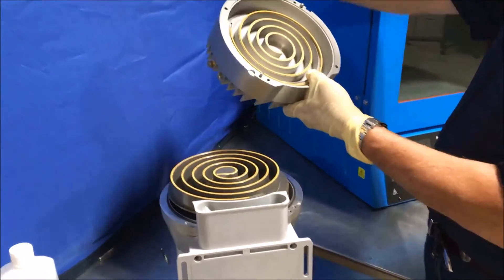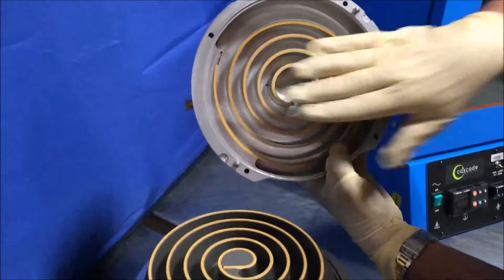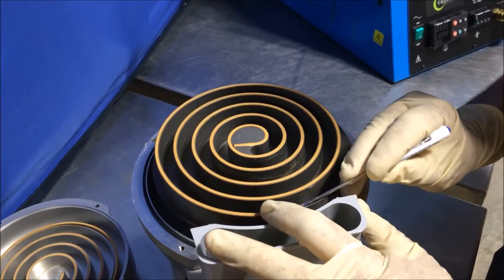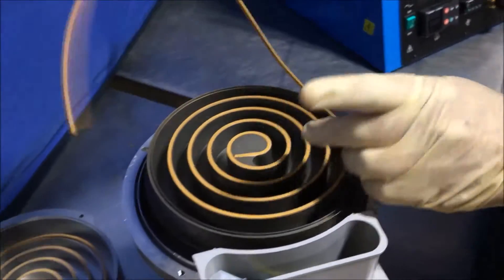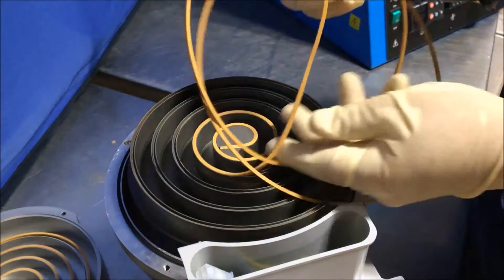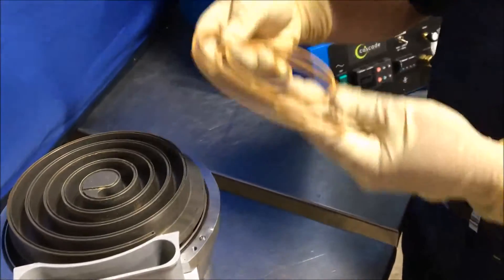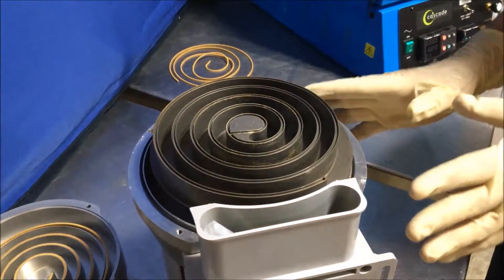Turn it around and there you have the two mating scroll sets and their tip seals. To remove the tip seal, carefully take a small screwdriver and pry up the end of the tip seal and unwind it from the groove that it sits within the scroll set. Set it aside, noting which side the tip seal came from — this is from the side that belongs with the pump.